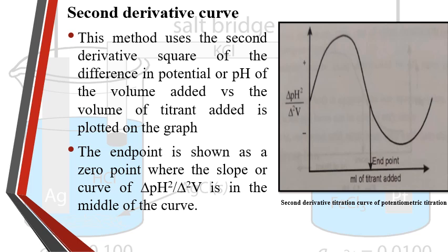When we talk about calibration and analysis, the second derivative can also enhance interpretation of the calibration curve. You create a calibration curve with electrode potential plotted against concentration of the analyte. You compute the first derivative to get a clearer view of the rate of change in potential with concentration.